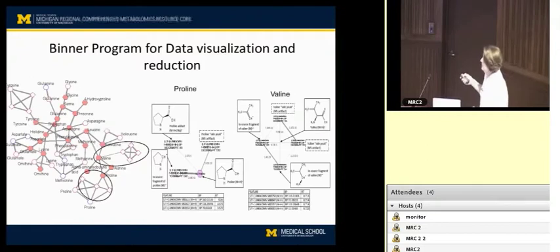You want to be able to take your metabolites and start mapping them to pathways. And as you'll hear a little more about later, you can't always just map your metabolites to pathways. Either the pathways are not necessarily correct in terms of the actual biology going on, or you have compounds that don't have a KEGG ID that is easily mapped to a pathway.